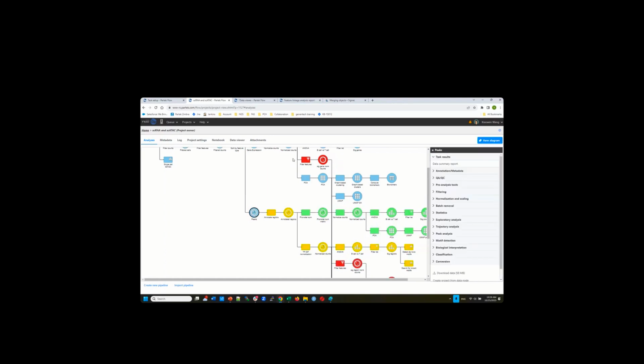As you can see, I use a different color to indicate the different kinds of assays. I use yellow to represent the peaks. So now we're going to go to peak analysis, then annotate regions. This is very much the same as when you do bulk ATAC-seq. We're going to utilize some single cell techniques we learned from single cell RNA-seq, and also some concepts from our bulk ATAC-seq.